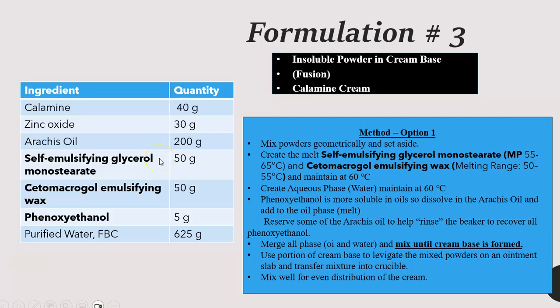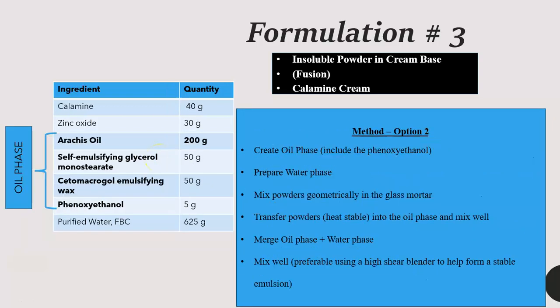This recipe is a little bit more complicated, but let's look at the next slide. Here, I've tried to break it down for you. This is a little bit too complex and we don't really have the raw material to make this in the lab, but it's good to be aware. The arachis oil, the self-emulsifying glycerol, and the cetamacrogol, and even the phenoxyethanol all mix in the oil phase.